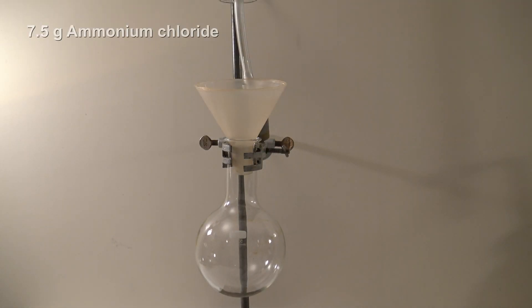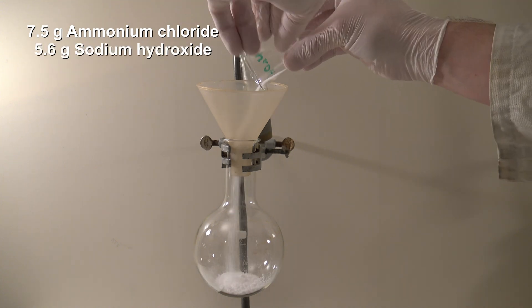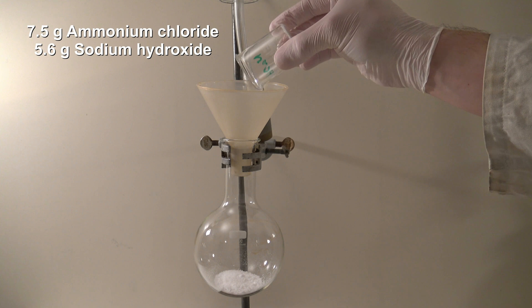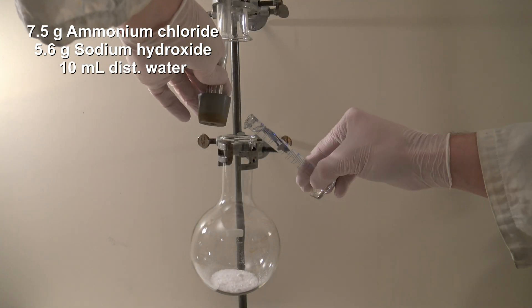Next 7.5 grams of ammonium chloride and 5.6 grams of sodium hydroxide are added to the lower flask. After adding 10ml of distilled water the flask is closed immediately.